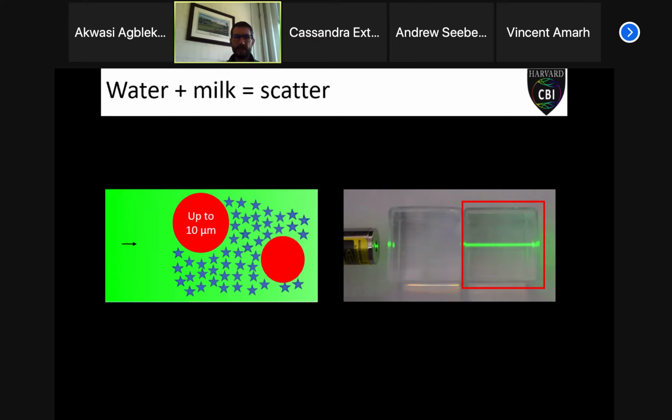So if we're trying to image fluorescence deep in that mouse brain that I showed you earlier, the laser that we're using to excite our sample, as it tries to be focused deeper and deeper into the tissue, is losing more and more energy as that light scatters away. And probably more importantly, the fluorescent molecules deep inside our tissue are giving off fluorescent light that is scattering on its way back to our objective. And so this is why things get darker and darker as we image deeper and deeper with our microscope.